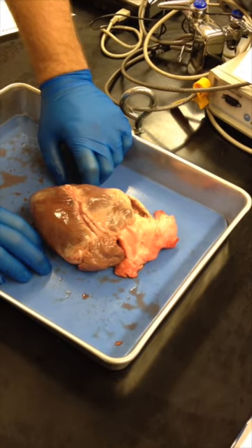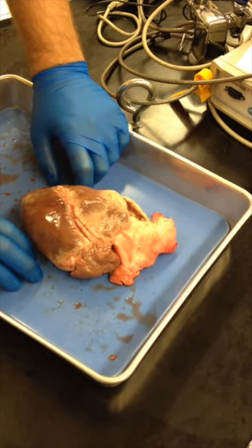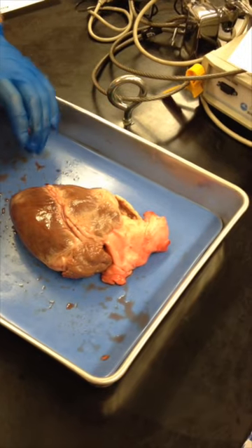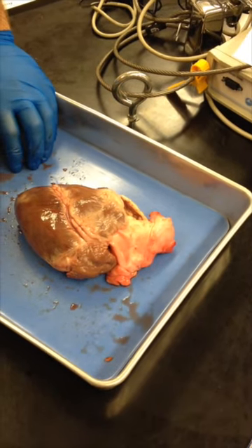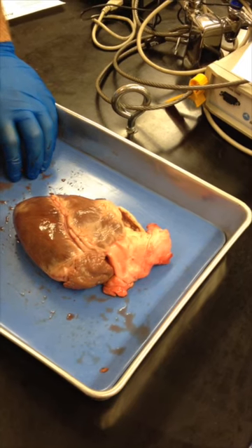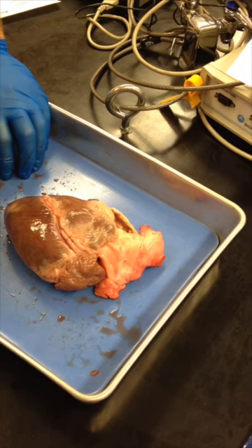Oh, we know what the mediastinum is. Isn't that another name for your thoracic cavity? Oh, is it? It's because the next one's the pericardial cavity. That's where it holds the heart. And the mediastinum is something like that. I can't remember what it is, but anyways, it's not actually on the heart.